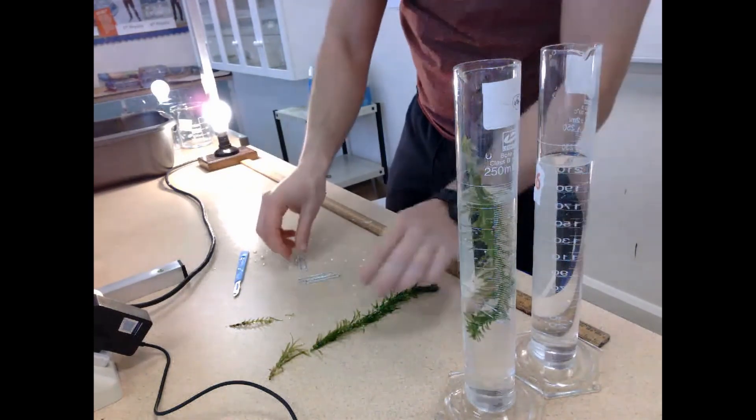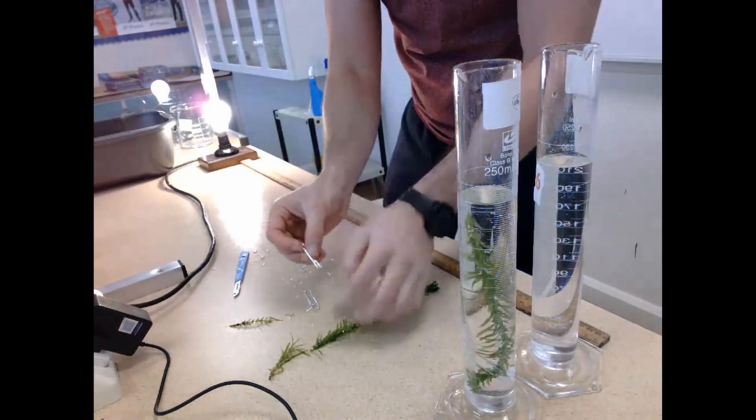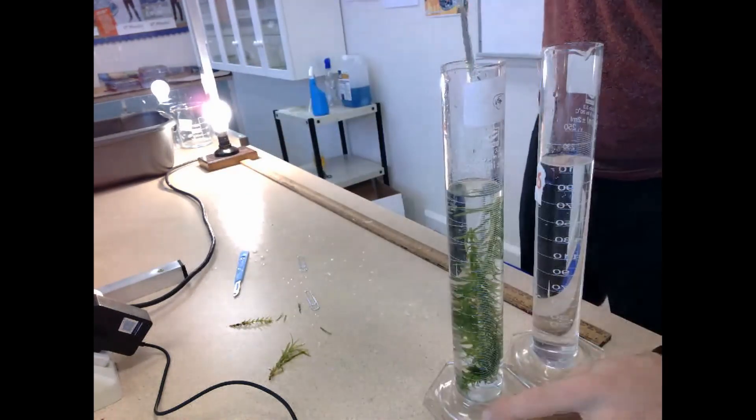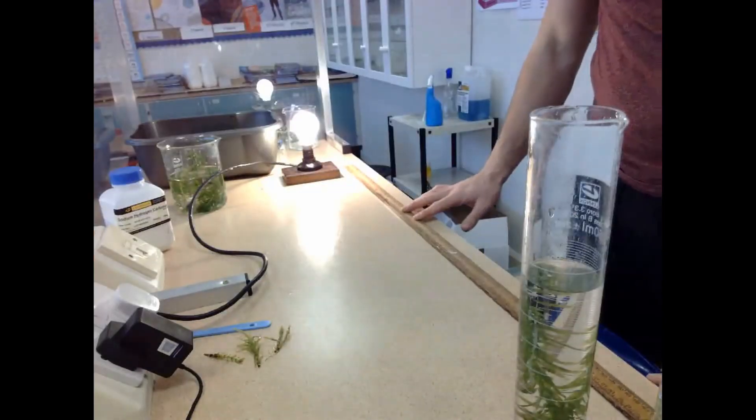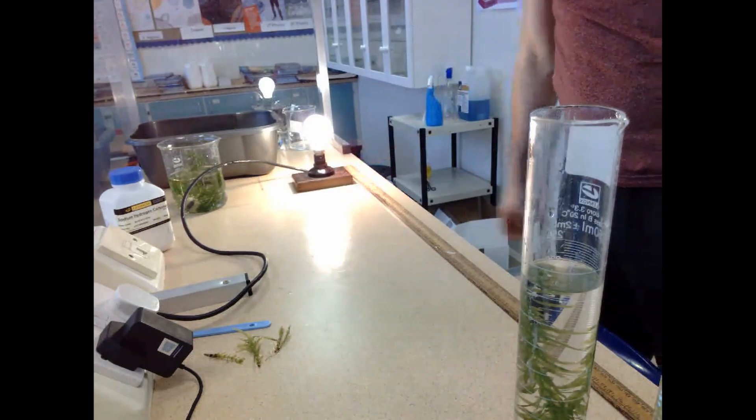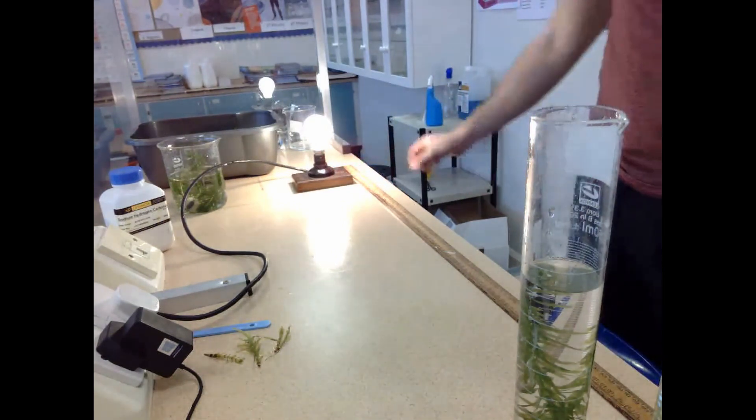To begin with, the light bulb is left a full meter away from the graduated cylinders, and what you're going to see is there is going to be very little production of bubbles. And this is because the light intensity isn't going to be that great.